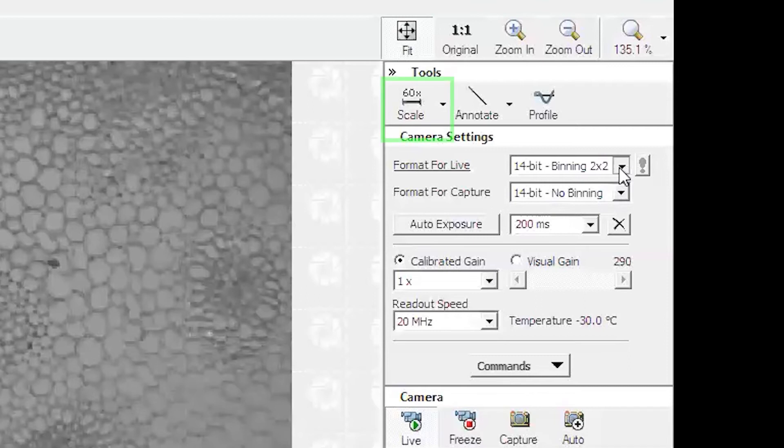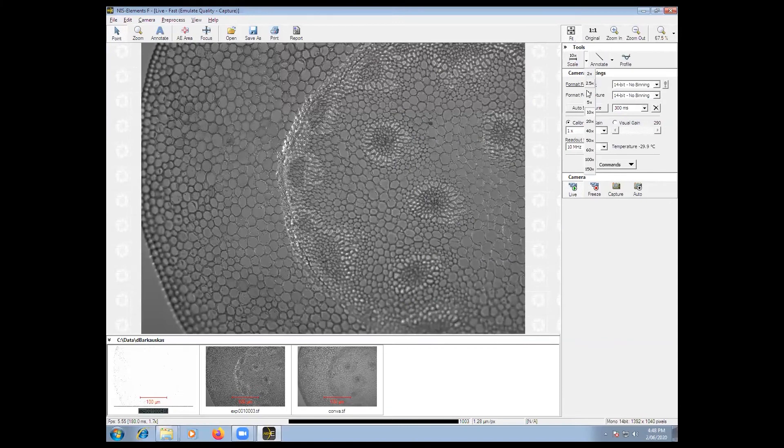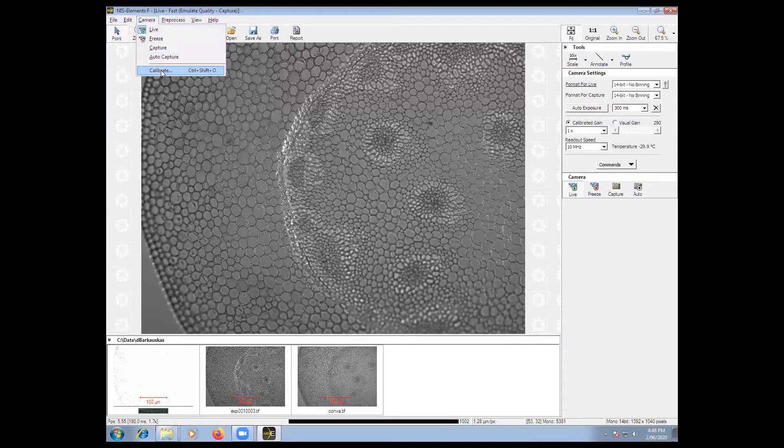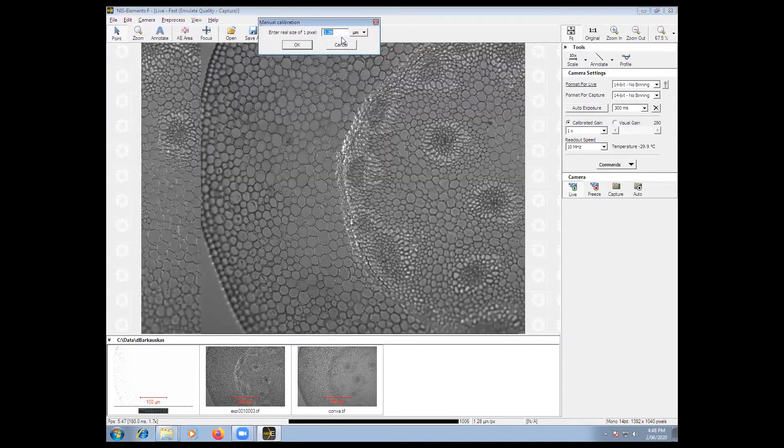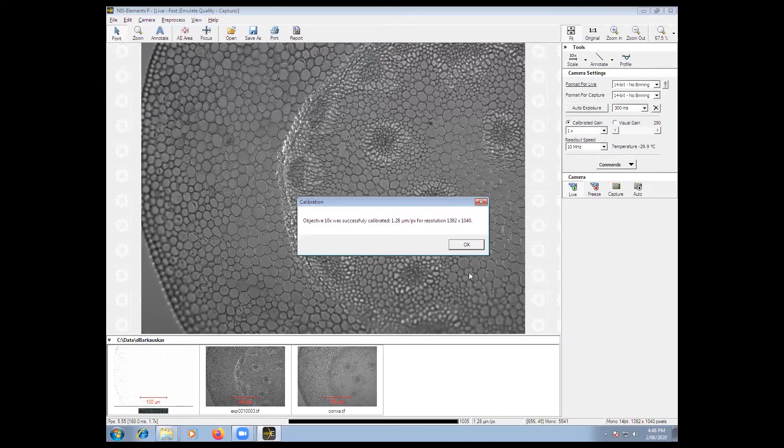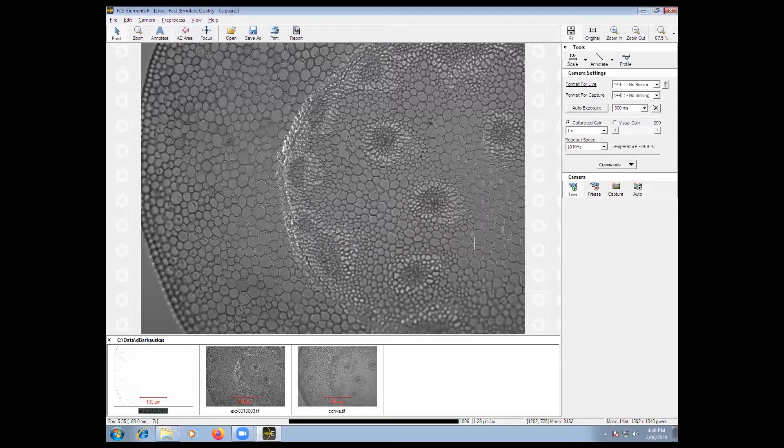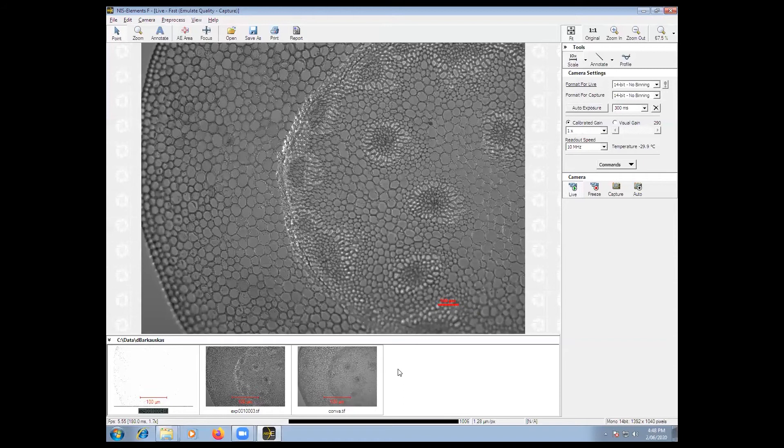NIS Elements F does not automatically detect the objective and as such it does not know the scale of your image. To include the scale bar, under scale change to the 10x objective. Then go to camera, calibrate and enter the number of microns per pixel which is on the sheet on the table, which has been measured by the facility staff. This will provide the information to the software to put a scale bar in the image.